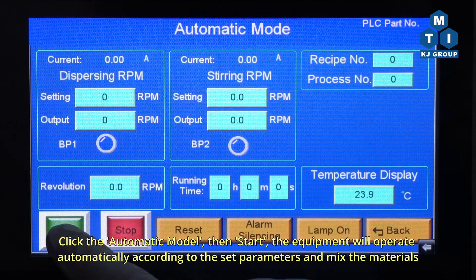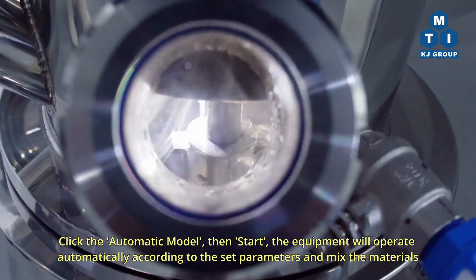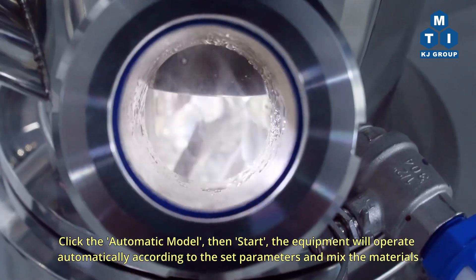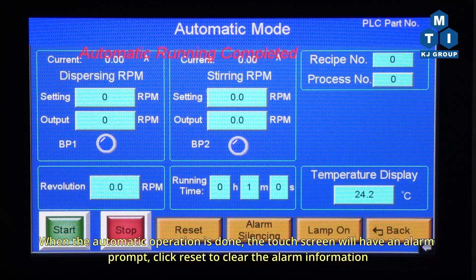Click the automatic mode, then Start. The equipment will operate automatically according to the set parameters and mix the materials. When the automatic operation is done, the touchscreen will display an alarm prompt. Click Reset to clear the alarm information.